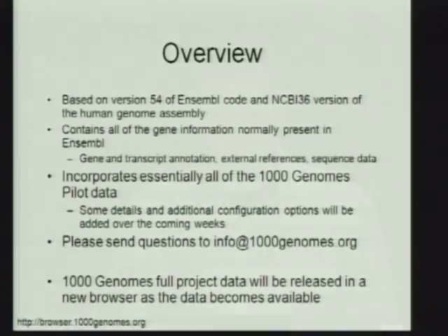The pilot project browser incorporates essentially all of the 1,000 Genomes pilot data. There are still a few details we continue to add and refine. Eventually the pilot project will represent a stable collection, and we will keep it in perpetuity to view the 1,000 Genomes pilot project data. As we release data on the full project, we're actually going to create a new browser for that — so there will be a stable pilot project browser, and then a new updatable browser as we continue to release data going forward.